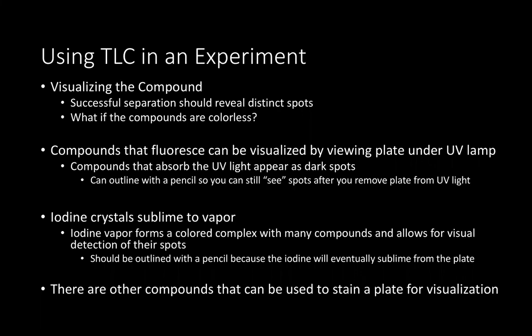However, depending upon what you do in terms of research and in your future, there are plenty of other compounds you may come across that you can use to stain a TLC plate for visualization.